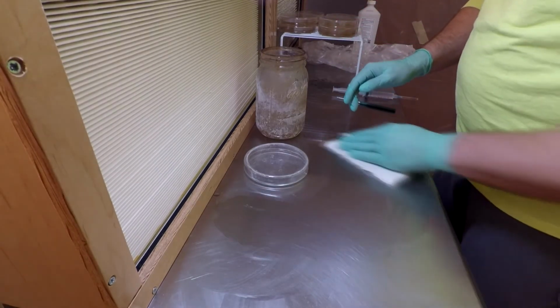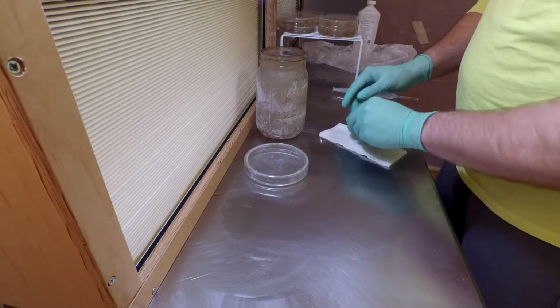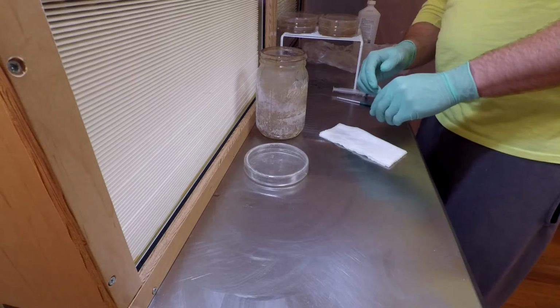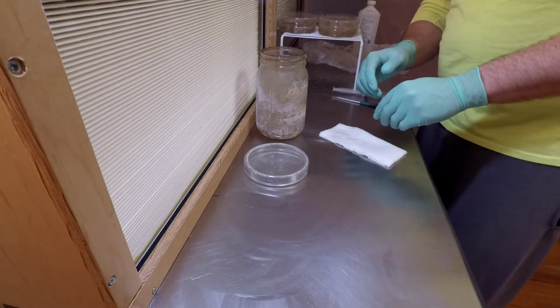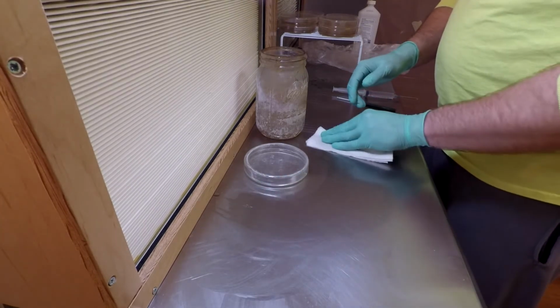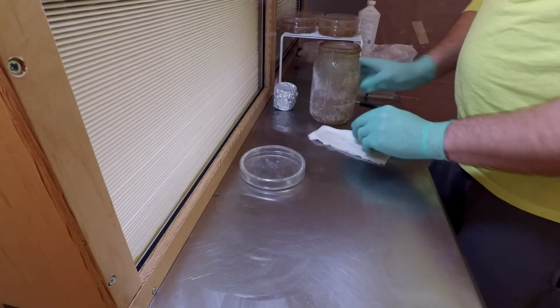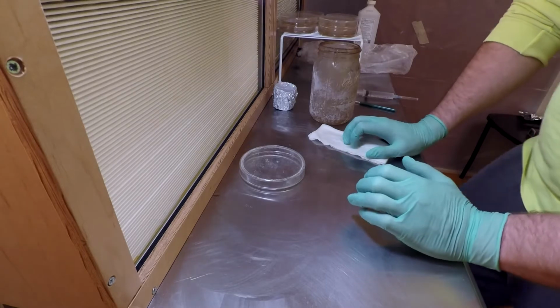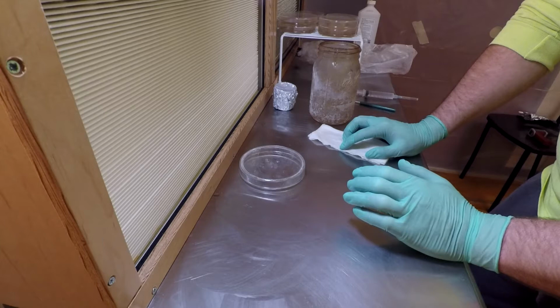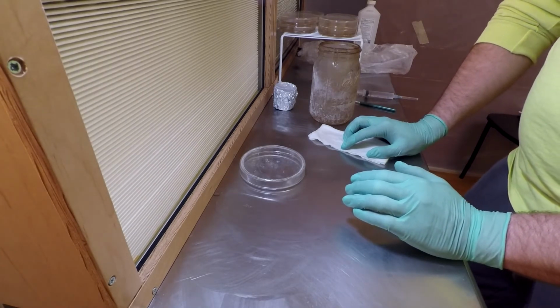Didn't get enough agar to go to the edge of the dish, but I can still use that one. The streak spores across. Yeah, so the first dish I made just has a light bit of fog on the top, but no drips. So that should be pretty good. I'm gonna give those all about half an hour to completely cool down to where I can inoculate them, and then the agar will firm up completely then.